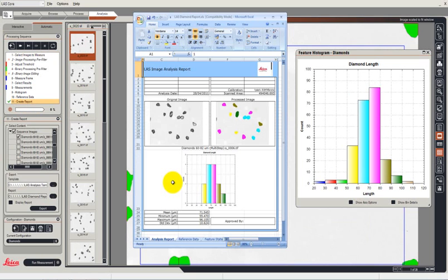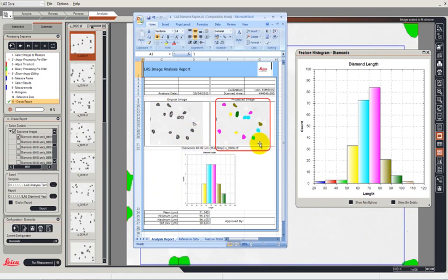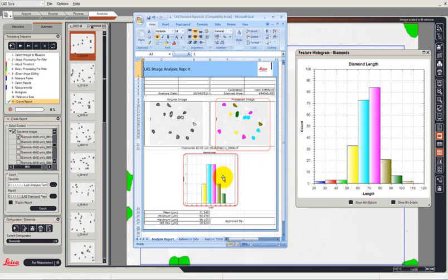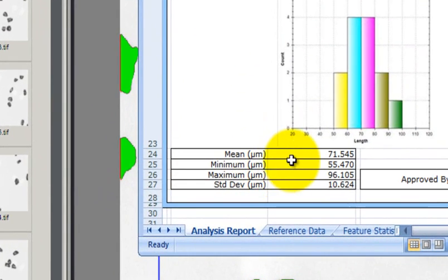And you can see that in this we've transferred an example image. Clearly we're not wanting to print out all 20 images. We've transferred an example image, one image that has been classified, and the histogram as well. At the same time we've printed out the various statistics for this particular distribution.